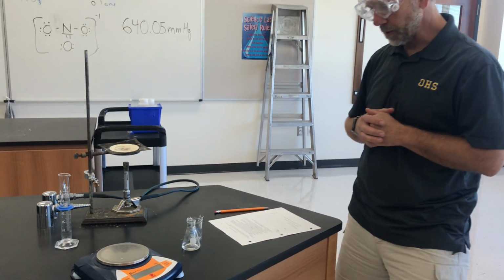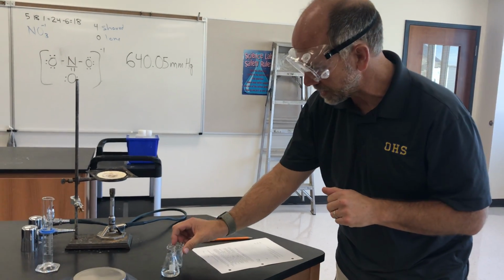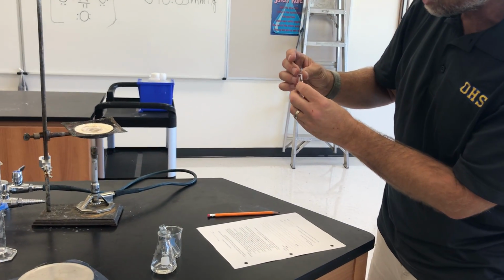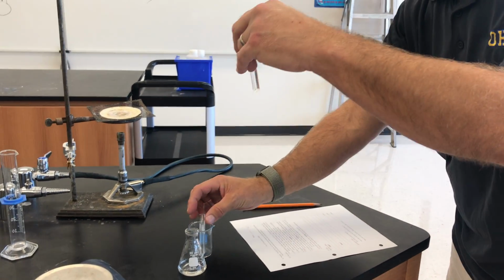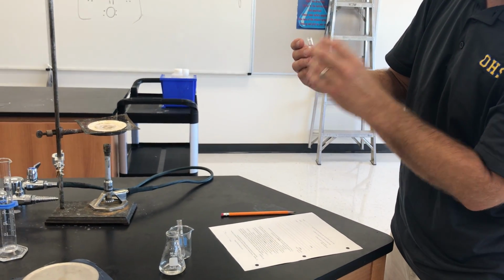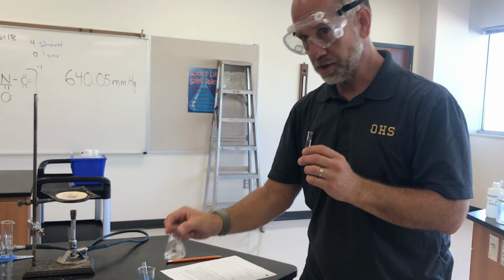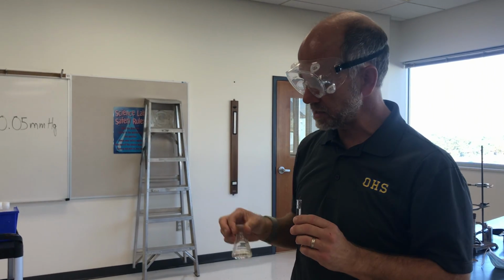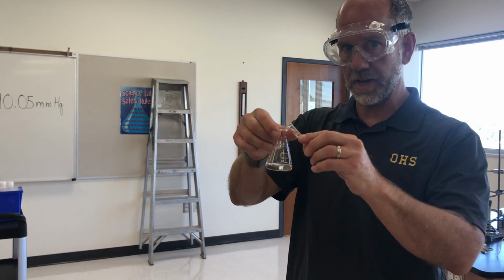So as it says in step number 5, we're going to pour the contents of the calcium chloride test tube, making sure that I get the correct test tube. Yep. Okay, so making sure that we have the calcium chloride test tube, we are going to pour this into the sodium carbonate test tube. Then, as it says, we're going to swirl and then record our observations.